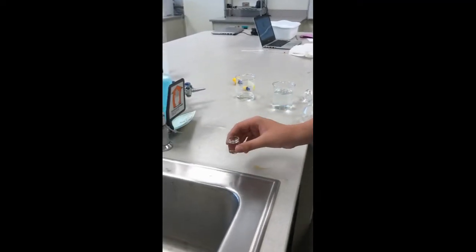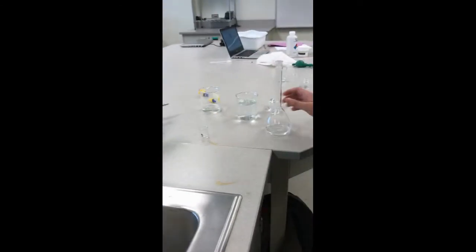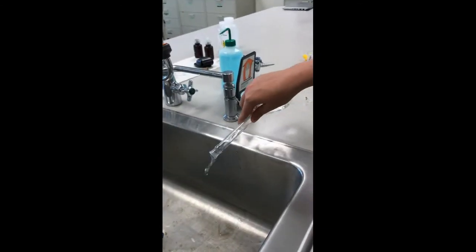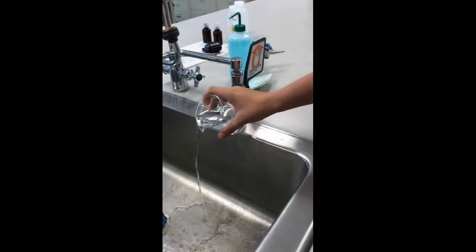Since this is a saltwater solution, we can pour these directly into the sink. However, if you have anything else that needs to be properly disposed of, it can be put in either a non-hazardous waste container or a hazardous waste container.